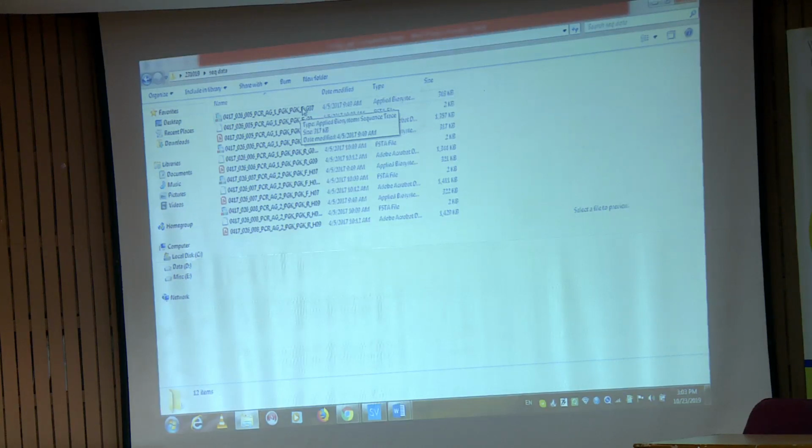There is one more software you can write down, there are plenty, but you can write down one, Finch TV. That software will help you to view these chromatogram files. There is another software, DNA Baser.